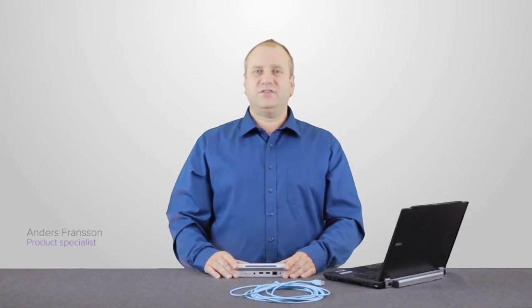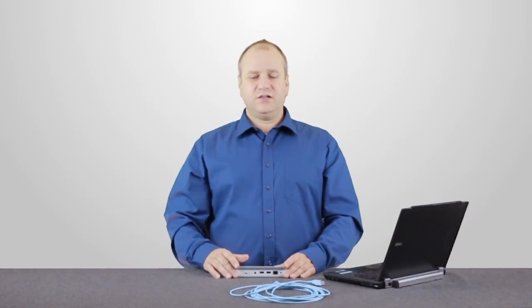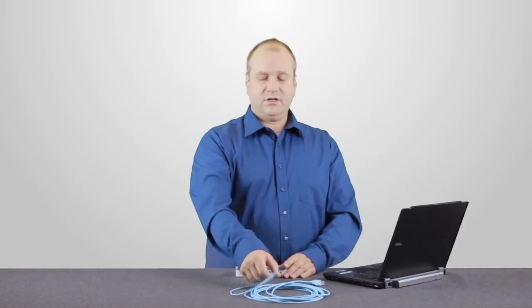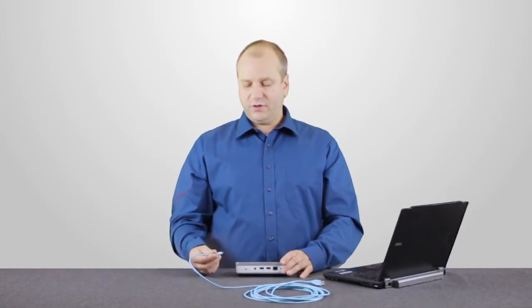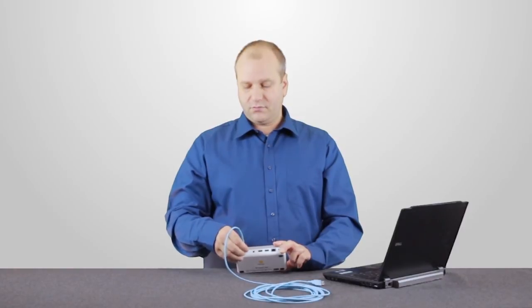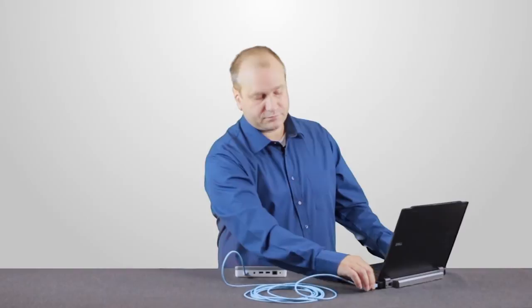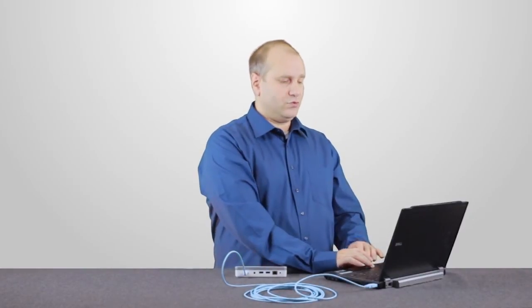In this video I want to show you how to get your measurement data from the X2 base unit to Microsoft Excel during measurement. Connect the USB cable to the charger and PC port of the base unit and the other end to a computer, and start the X2View software.